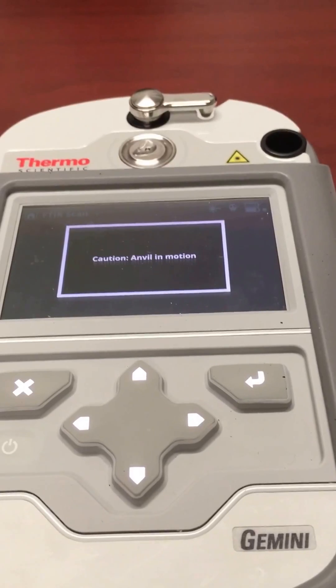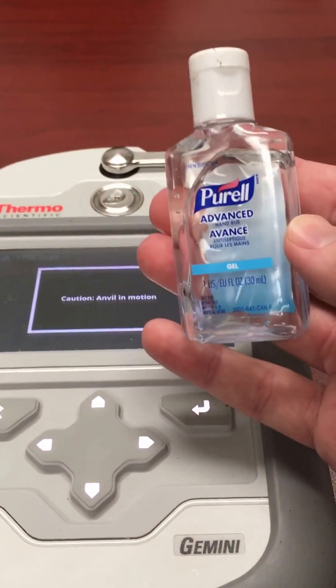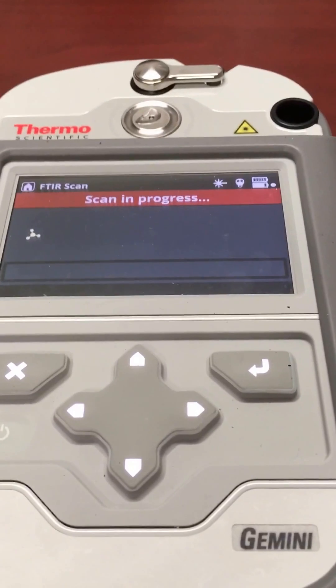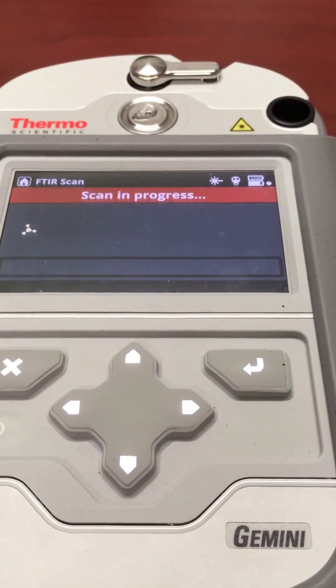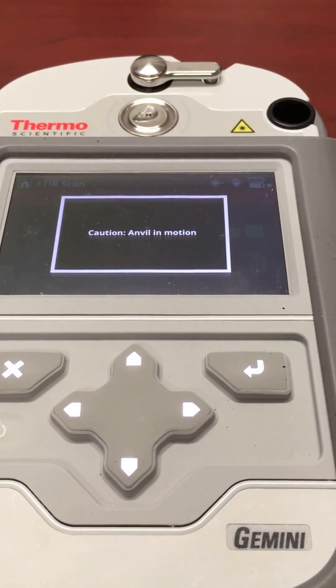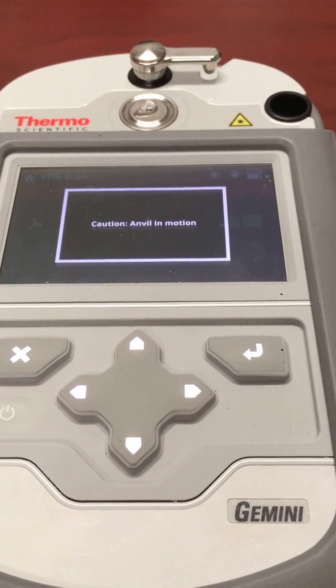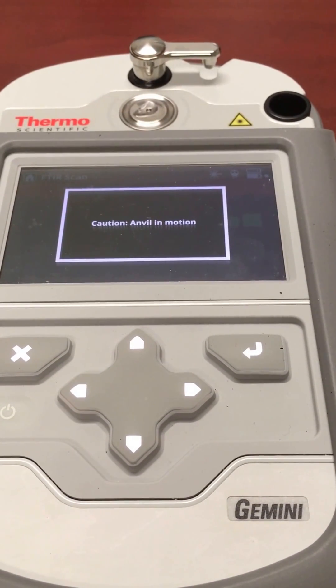Now just for this demo, I'm using Purell just to get a result. The anvil is moving. Normally that would be used if it's a solid, but I won't swing it over for this gel.